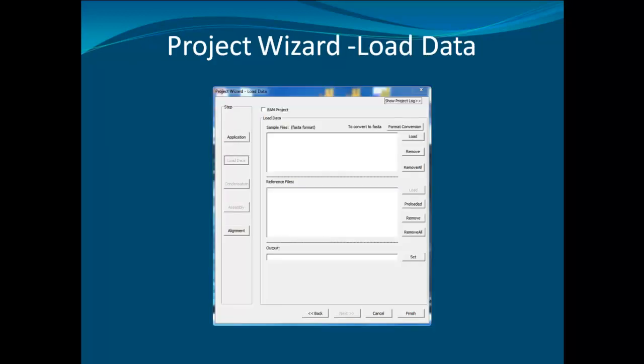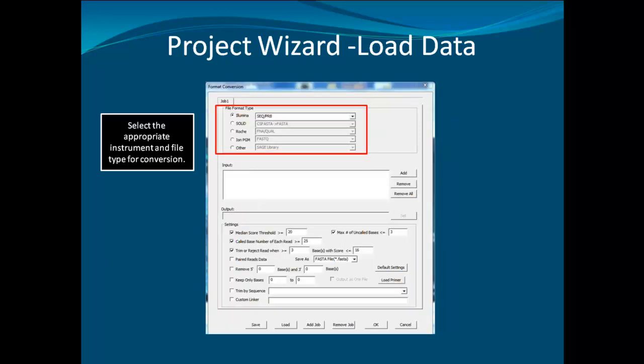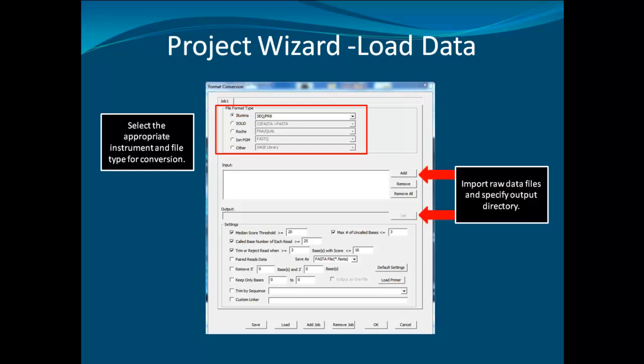In the Load Data window, click on Format Conversion to convert the raw data to FASTA files for analysis. In the Format Conversion window, select the instrument type and use the drop-down menu to select the appropriate file type. Next, click on the Add button to import data and specify the output folder. Default settings work well for most data sets, but can be adjusted if desired.